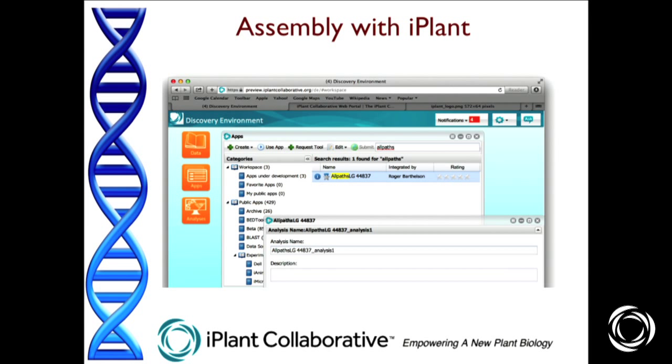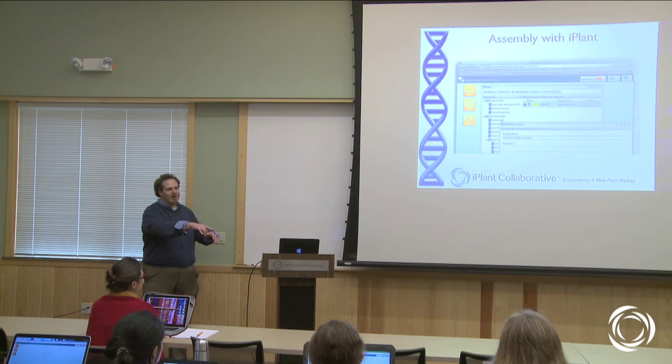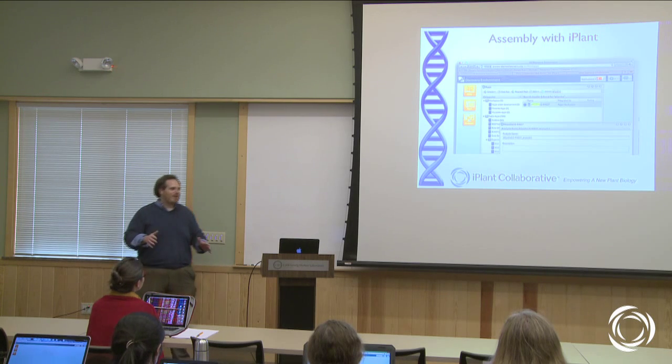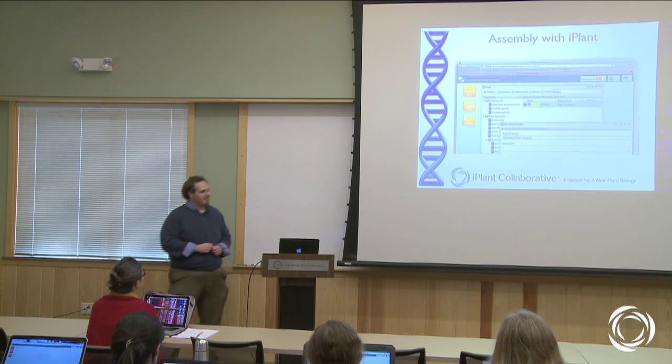The reality of assembly is that it's not a real-time activity. To do a gigabase genome, you're talking about days of compute. Even a microbe is going to be many minutes to hours. So my strategy for this part is, we're going to do it a little bit like a cooking show. I'm going to show you how I prepare the ingredients, prepare the assemblies. I'm going to push go, but then I'm going to switch to the other oven that has the results already for you. So just bear with me. I'm going to be playing this game a little bit.